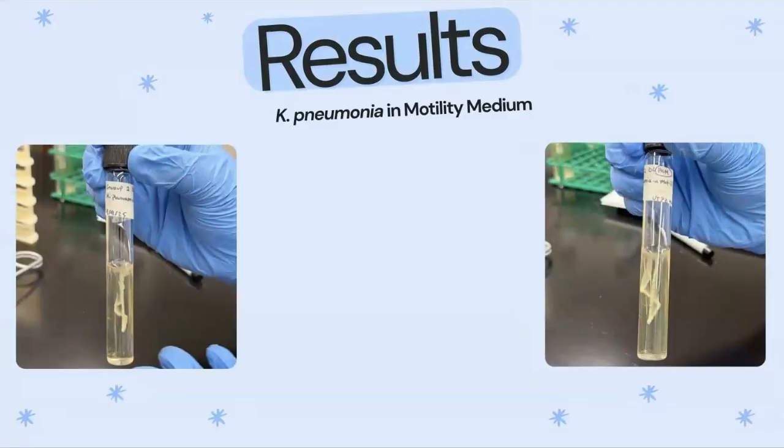Once we go to the K. pneumonia in the motility medium, we once again were able to see the growth very well in the same linear fashion. Although the inoculation could have been more precise, as you can see that there are 2 visible lines of growth. However, we were still able to successfully grow them in this medium.